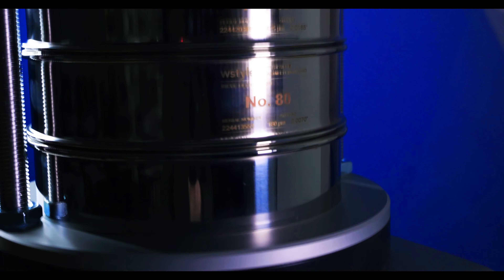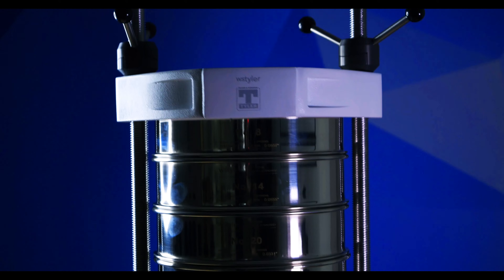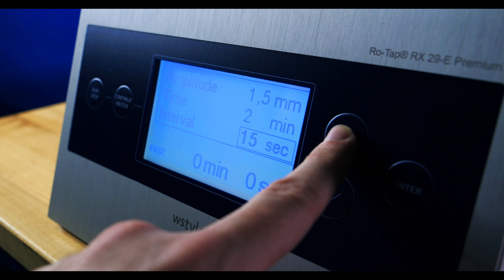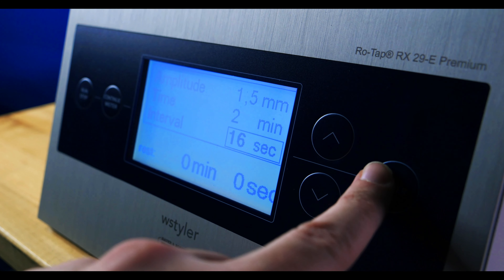When conducting a sieve analysis with the ePremium, the machine is designed to pause several times throughout the sieving process. This helps ensure that the particles can settle on the mesh of the sieves and fall through the openings if they're smaller than the opening. Because the ePremium allows the user to set the amplitude and pause intervals, you can really dial in the optimal sieving combination after a thorough end-of-sieving analysis is conducted.